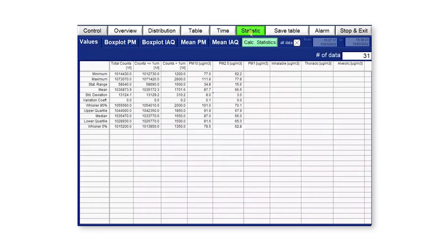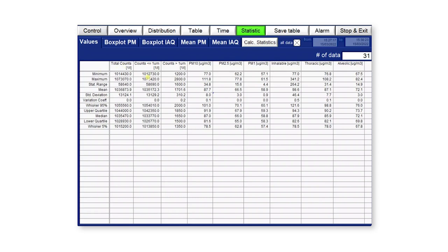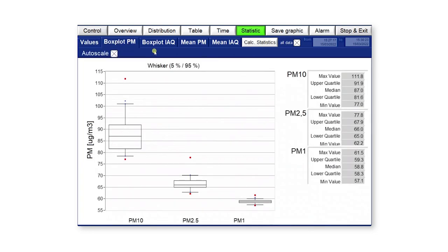The statistics tab shows values being measured with units in counts per litre and microgram per meter cube. You can calculate stats and plot graphs. A box-and-whisker plot is shown at 5% and 95% confidence intervals for PM10, PM2.5, and PM1. The lower part shows the lowest range, the top line shows the uppermost range, the box shows the 5%–95% confidence interval, and the central line shows the median of the readings. You can also save all graphics or graphs at any particular point.